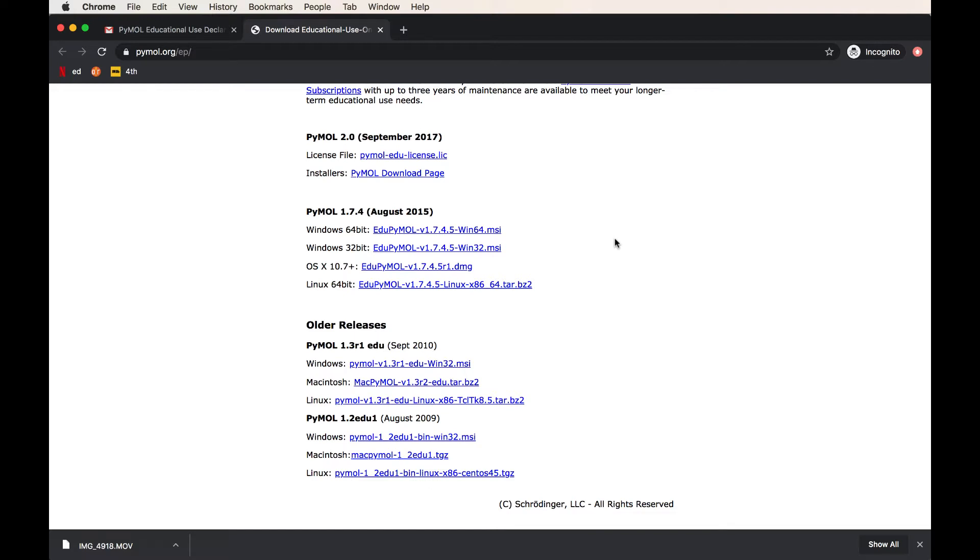So I would recommend to download one of the newer builds. One caveat here is that if your computer does not have a Windows, Mac, or Linux operating system, PyMOL will not open. So you can download this, but it will not work on a machine, for example, a Chromebook. This could be a problem for you. You'll need to install Linux on your Chromebook in order to download PyMOL.